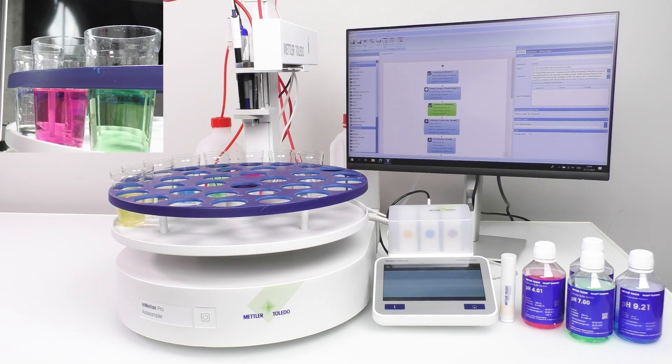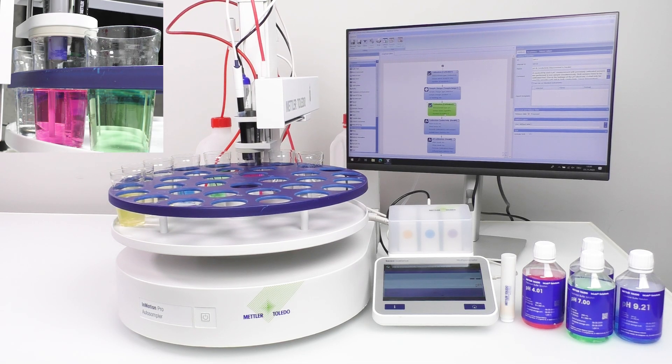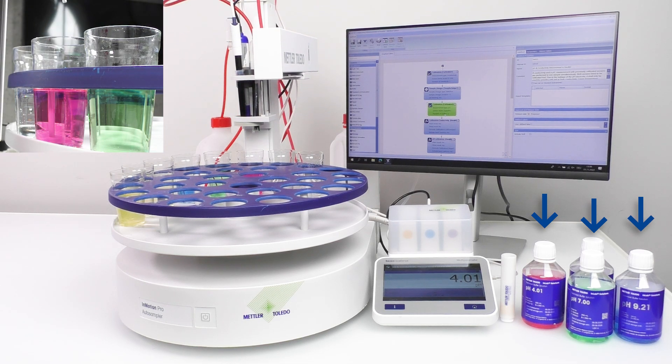With our in-motion auto-sampler, sensor calibration is a simple process that makes it stand out. You can quickly calibrate your sensors with pH buffer 4.01, 7.00, and 9.21, ensuring that you follow good electrochemistry practice.